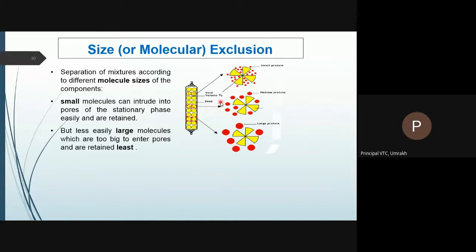Now, if the mixture which you need to separate has very small molecules, it can enter even inside the particles of your stationary phase.